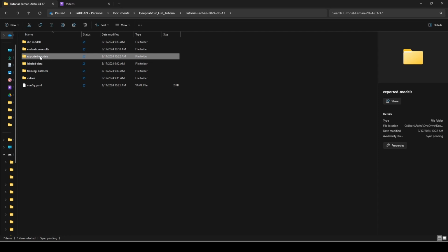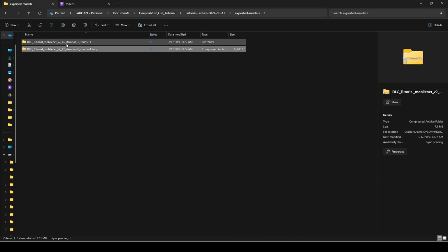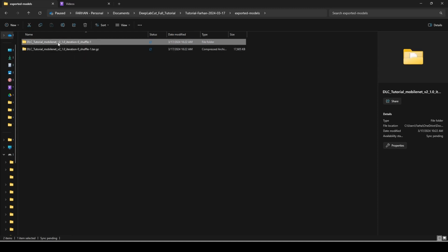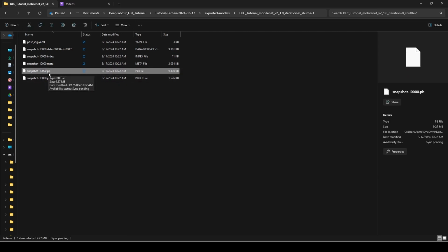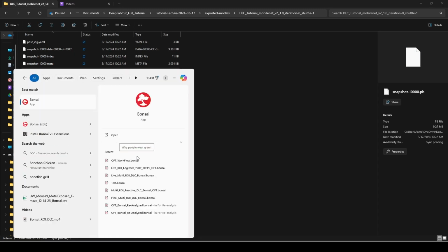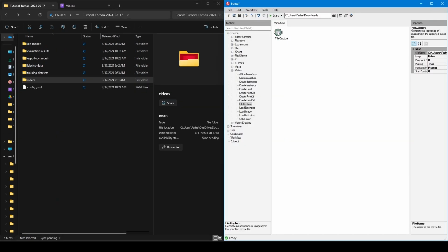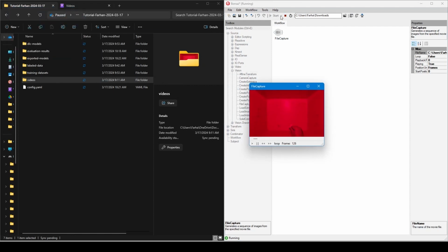Your exported model is in this folder. You have a zip file and also a MobileNet folder right here. These are the things that you need. Your .pb file is right here that you would need for your Bonsai. In fact, let's open Bonsai. So that's my video, and in order for me to play this video, I can hit that play button on the top and see the video is playing.